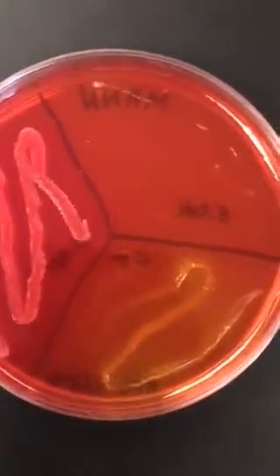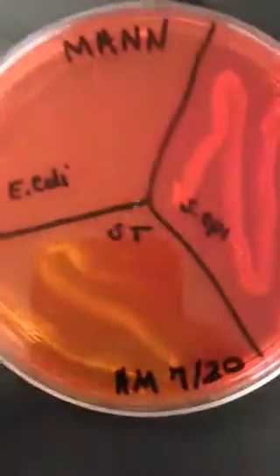Staphylococcus epidermidis, all over your skin. Micrococcus luteus, Micrococcus roseus, they could be there too. Staph aureus can be there. They're all Staphylococcus. Staphylococcus likes salt, so we add salt to the agar so they'll grow. Gram-negatives don't like salt, they won't grow.